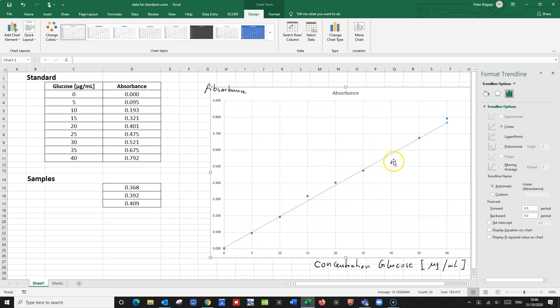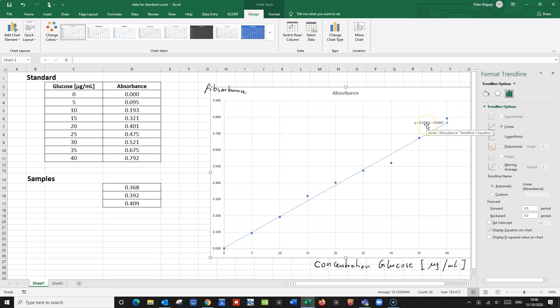We've got this one data point which is a little bit lower than we would expect, but in general it looks pretty good. We've got a line of best fit created from the data. We can also display the equation for this line of best fit on the chart, and we can display the R-squared value, which is the correlation coefficient for our line of best fit.